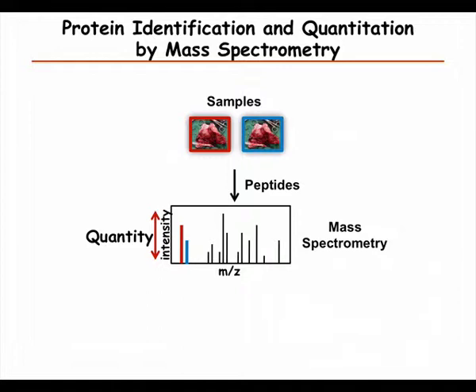And this is why what people do mainly in proteomics is compare the same peptide or same protein in different samples, but not to determine stoichiometry, where you in the same sample have to compare different sequences. That is much harder.